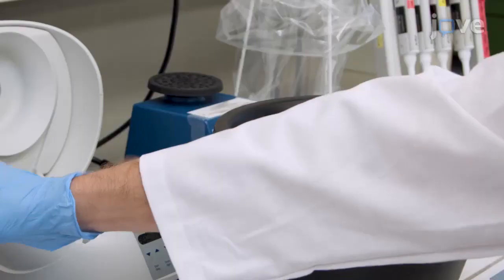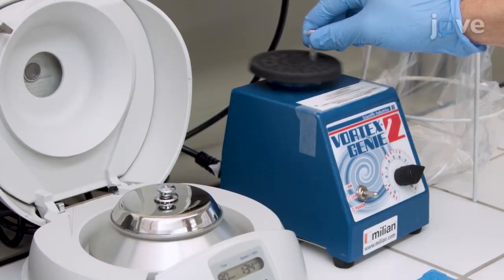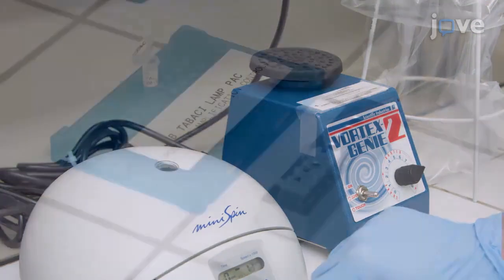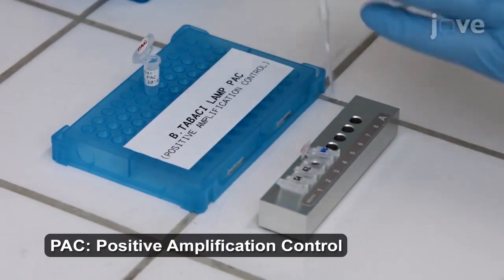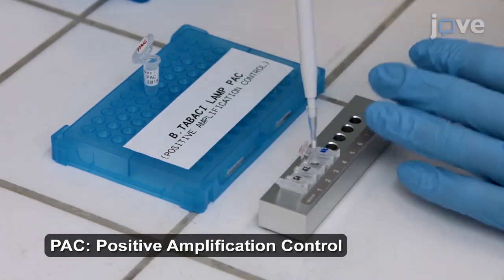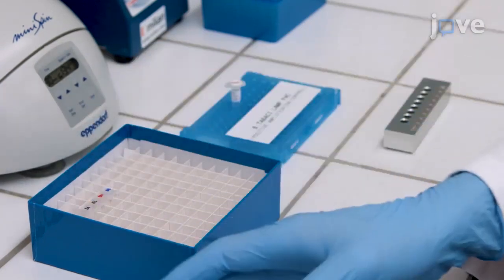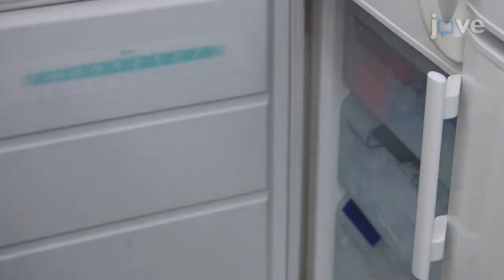Pulse centrifuge and put them on ice. Quickly vortex and pulse centrifuge B. tabaci LAMP PAC. Then add 2.5 µL into the tube labeled PAC in each of the 4-tube lamp strips. Next, close the lids and store the ready-to-use B. tabaci LAMP kit units at minus 20 degrees Celsius.